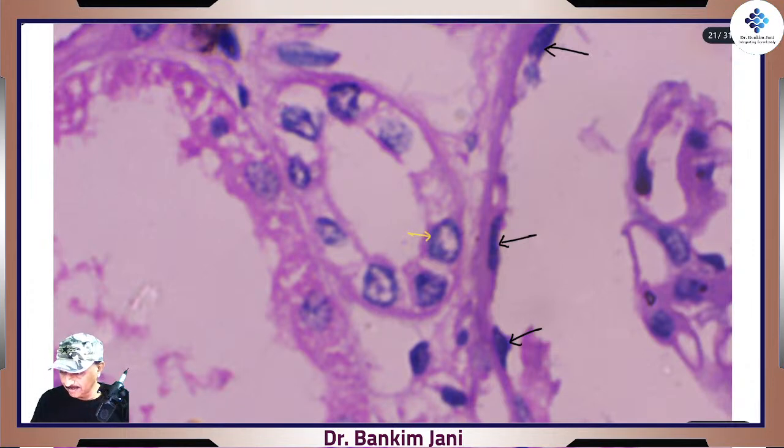They are so properly rounded and much bigger, so much so that in some cases we can even see the cell wall so nicely.